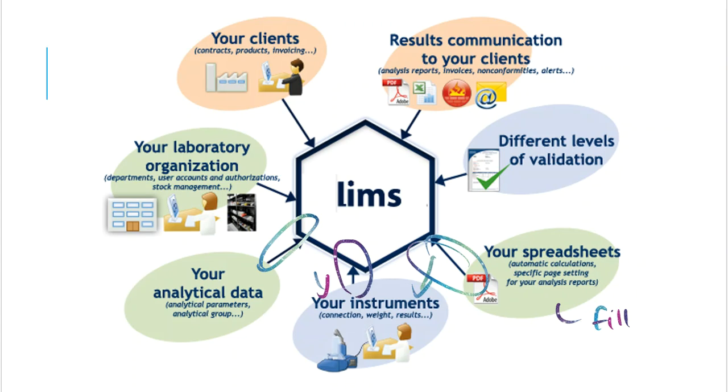It's like a form. So you take the raw data, and that raw data gets entered into a spreadsheet that's already made for you, and that spreadsheet will actually do all of the calculations for you. And that makes everybody happy, right? It makes the company happy because they know that all the math is taken care of. No one's going to mess anything up by calculators and not knowing how to solve equations. And that makes you happy because the only thing that you have to do is just plug in the number that you generate in a laboratory facility.